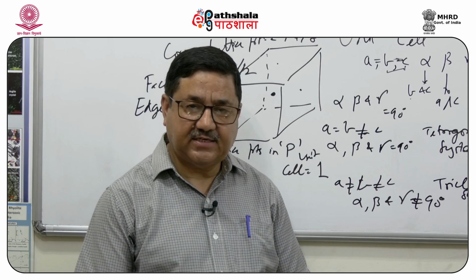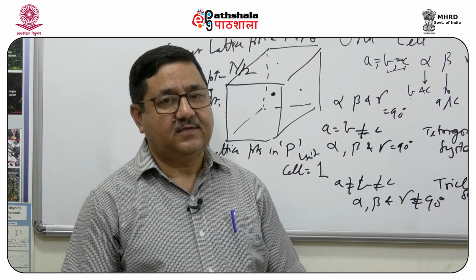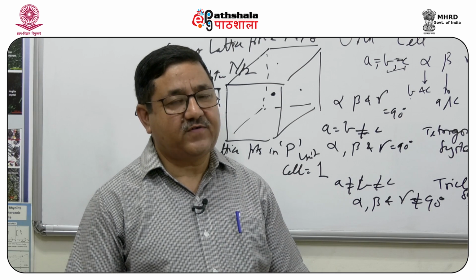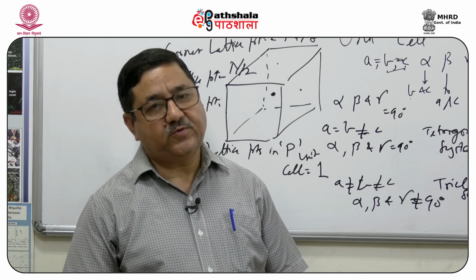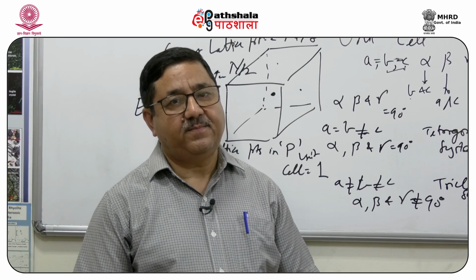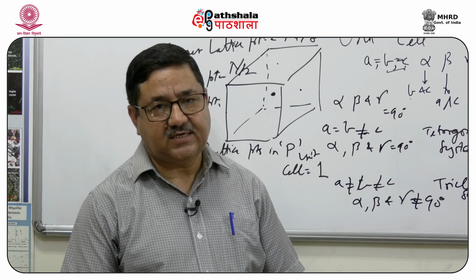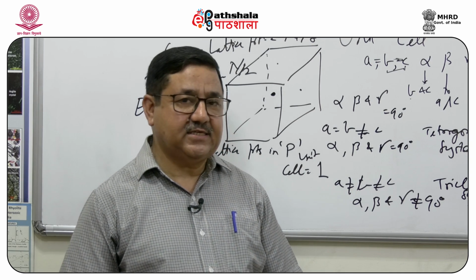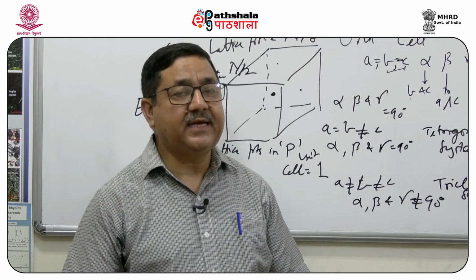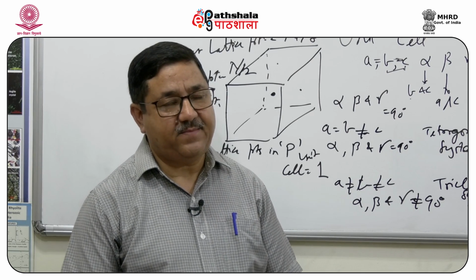For X-ray diffraction, we use a monochromatic X-ray, and the interaction constrained by Bragg's law of constructive interference produces the crystal planes, which we can index, measure and characterize in terms of their crystal structures, which in some cases can be used as fingerprinting for those minerals, and in other cases can be used to deduce other crystallographic parameters of that material.